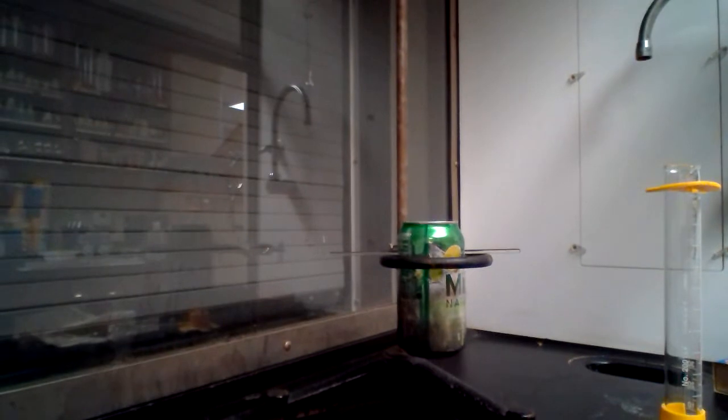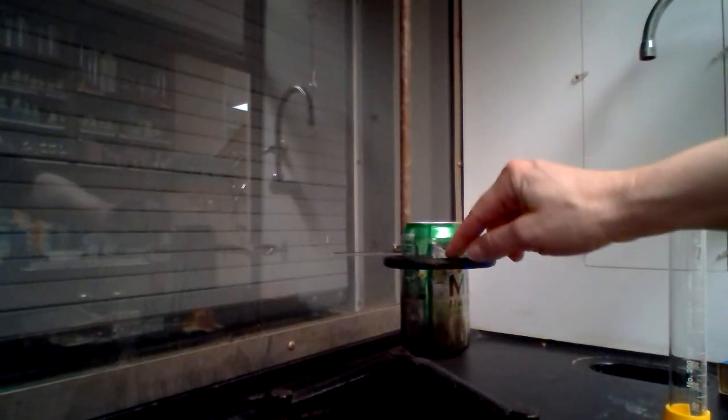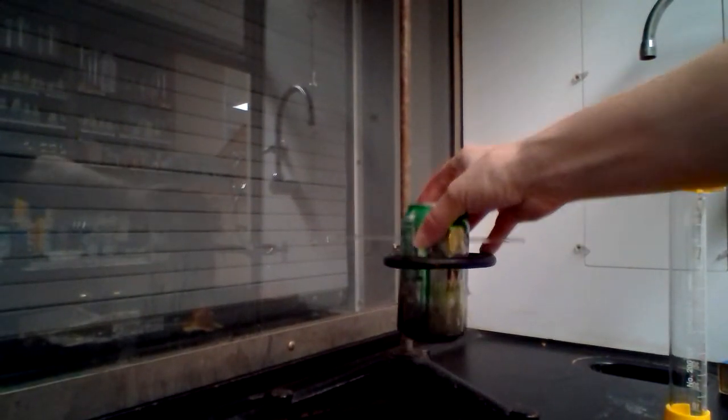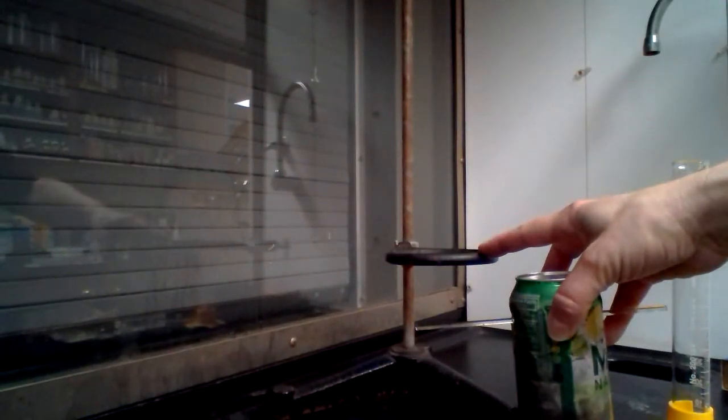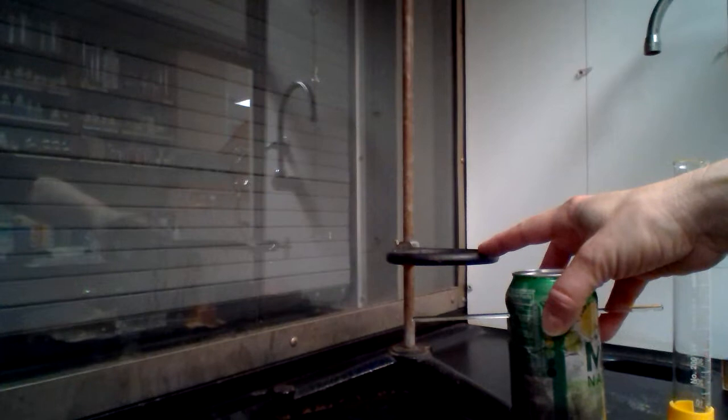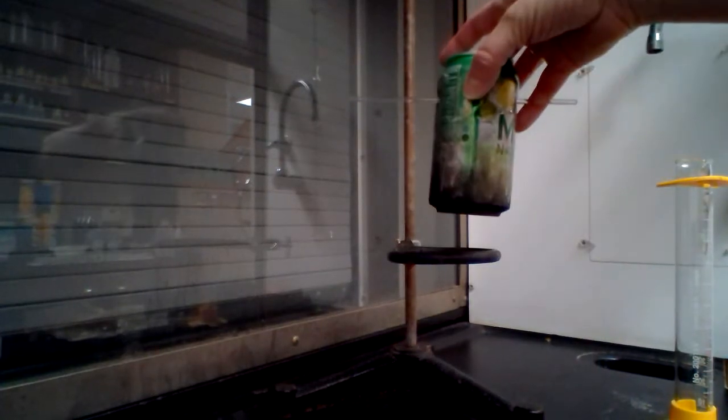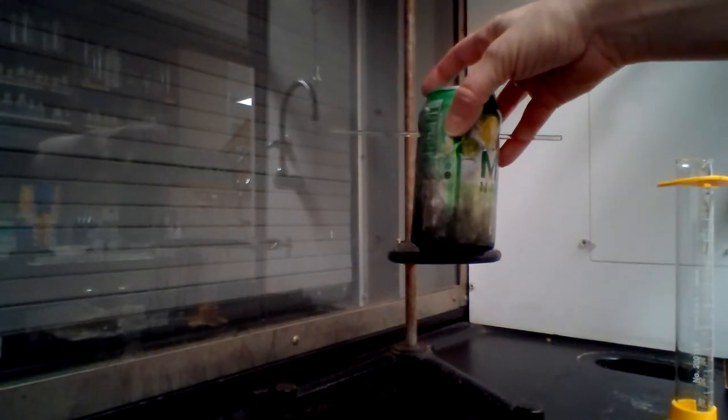And then along the ring stand we also have a ring clamp which will be used to suspend a pop can.